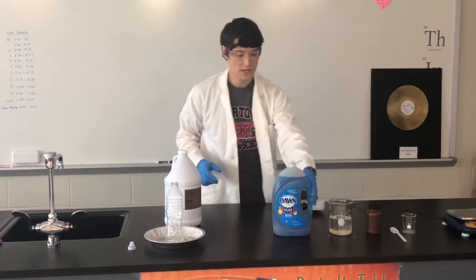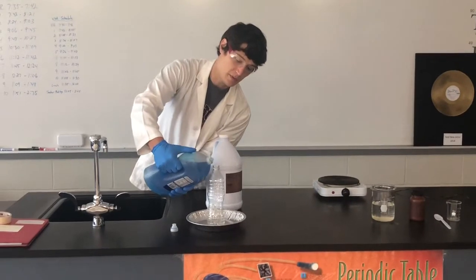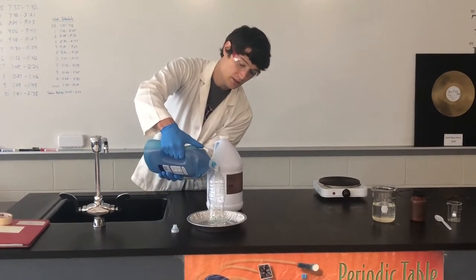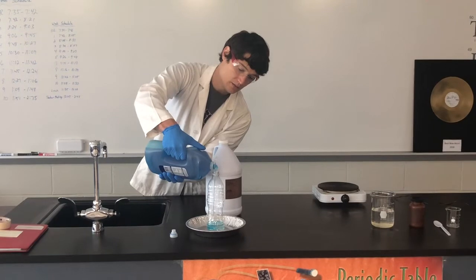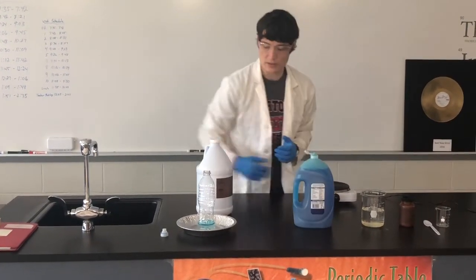I'm going to take a little bit of Dawn dish soap so we can see the reaction a little bit better. I'm going to take a little bit of water and squirt it in there. All right, give it a quick mix.